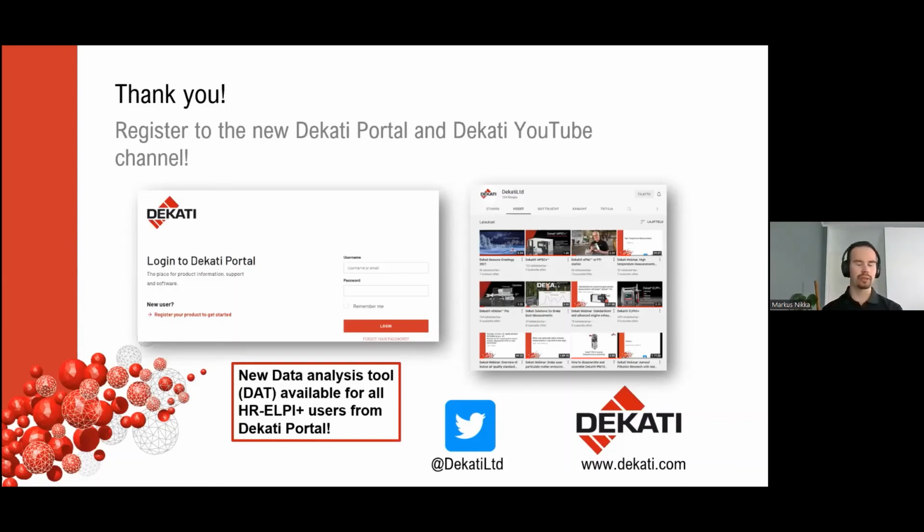This is still under development, how it will work with the PC software. Probably there will be an option to do both. There will be a slide bar or something similar where you can choose to turn on 4 lamps, and there is a predefined order in which the lamps are activated, or you can choose certain lamps as you want, as with the control box.